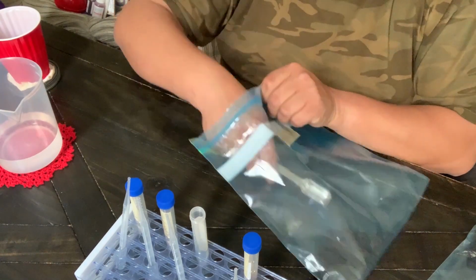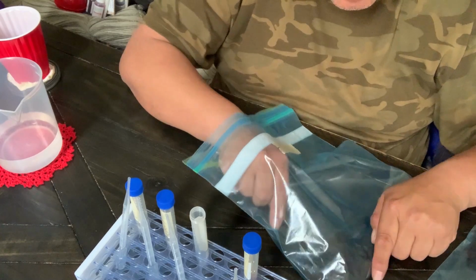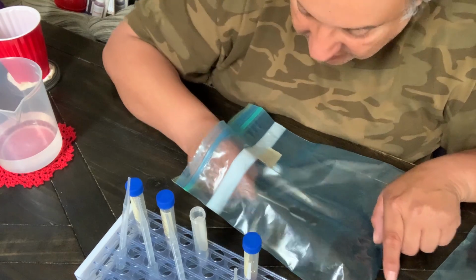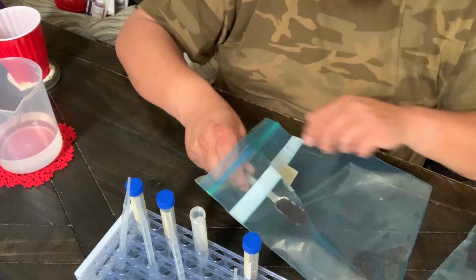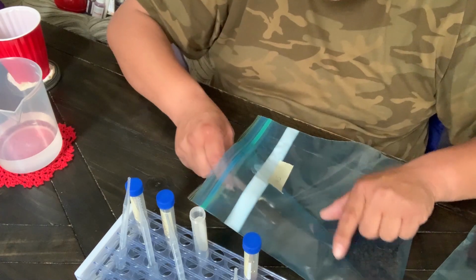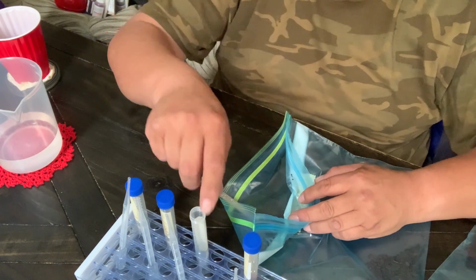Okay, so now let's take a teaspoon of this. It's all measured. This is 1 teaspoon or 5 milliliters. All right. So we got it here. And then we're going to keep it inside the bag so we don't make a mess.